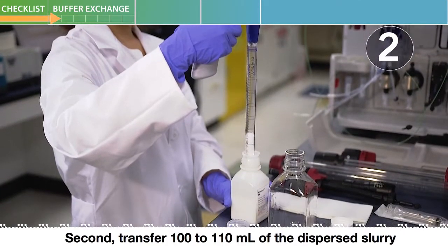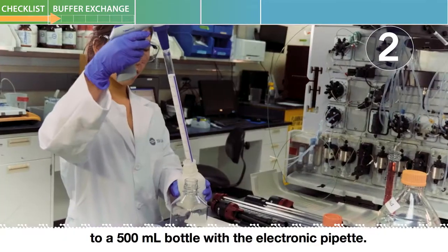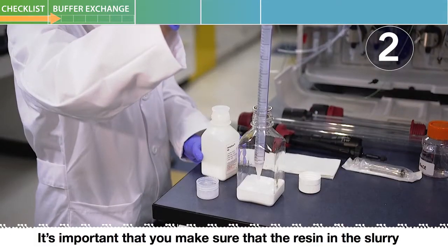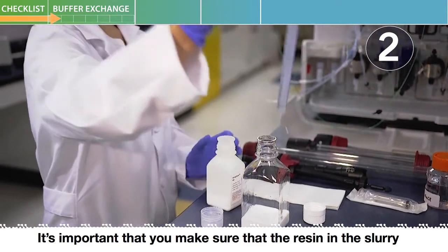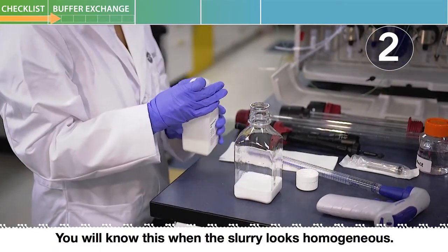Second, transfer 100 to 110 milliliters of the dispersed slurry to a 500 milliliter bottle with the electronic pipette. It's important that you make sure that the resin in the slurry is completely dispersed. You will know this when the slurry looks homogenous.